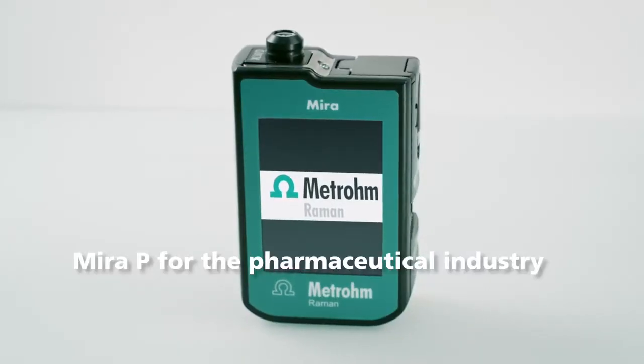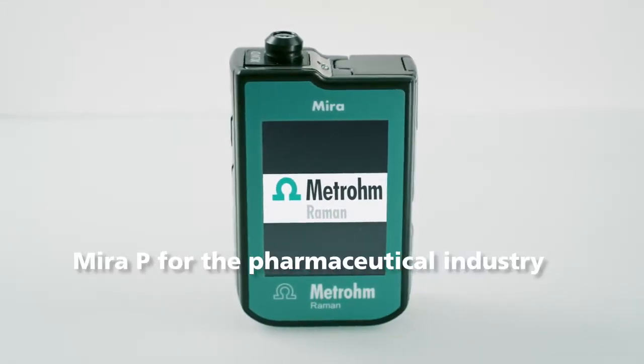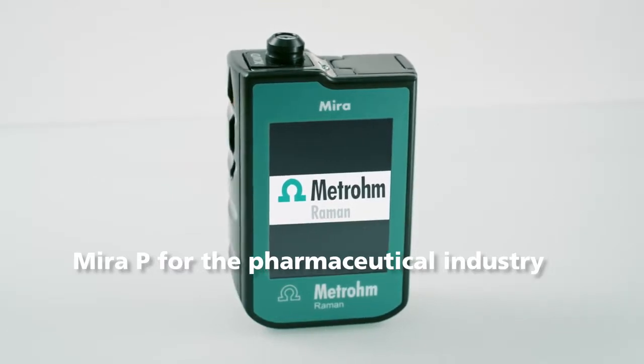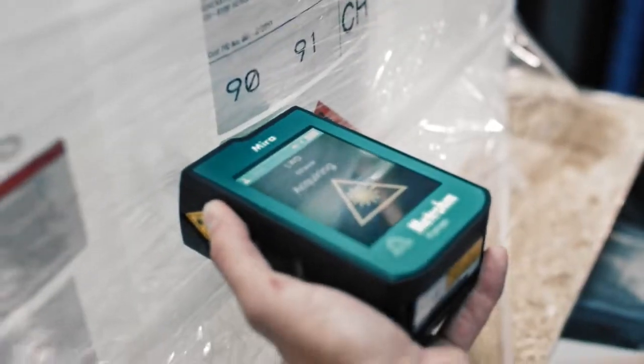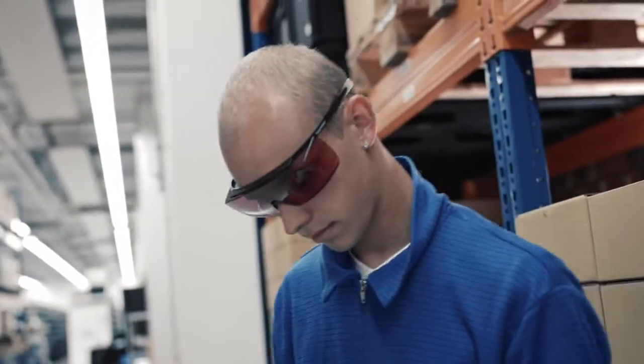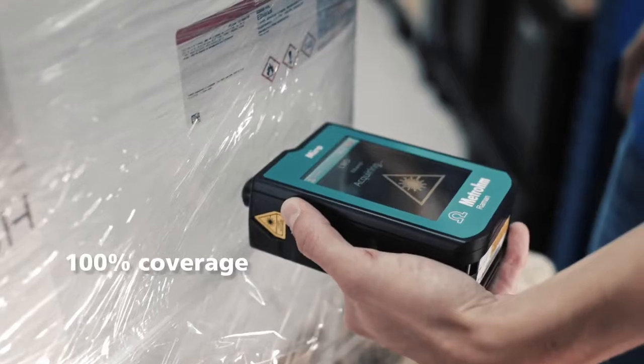Introducing MiraP, the new handheld analyzer for the pharmaceutical industry. Large batches with many containers? No problem. The container mode walks you through each container step by step.